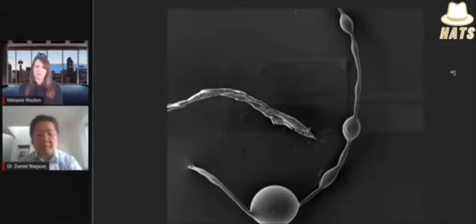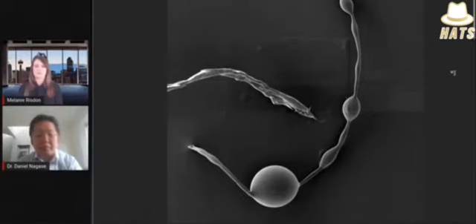So here it looks like there's two completely different types of strands. One strand looks like it could be a hair fiber or a dead insect leg, right? An insect leg would kind of look like that. Except if that was a hair or an insect leg, we would see biologics, right? It would contain biological elements. It would contain nitrogen or phosphorus. Okay. So we ran the spectrum on that thing that looks like an insect leg, nothing biologic, no nitrogen, no phosphorus. And then we have this thing that looks like a fiber with bulbs growing in it.